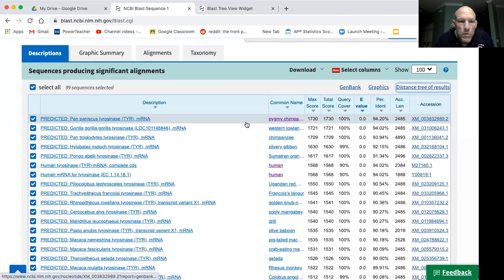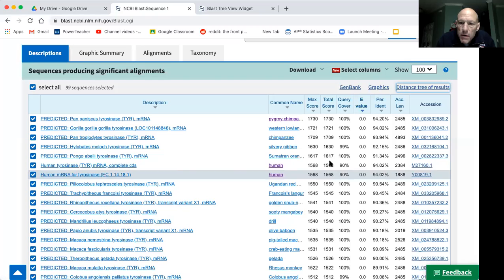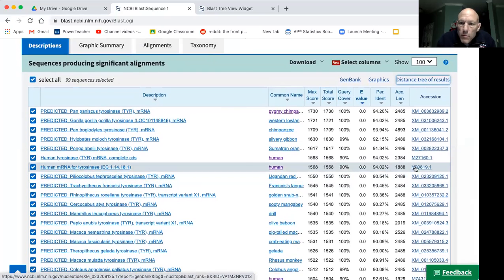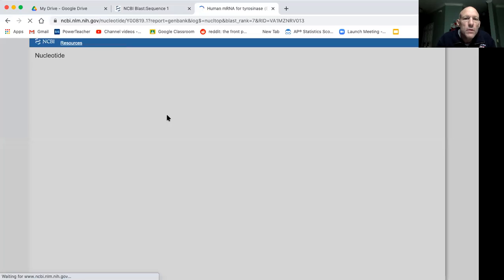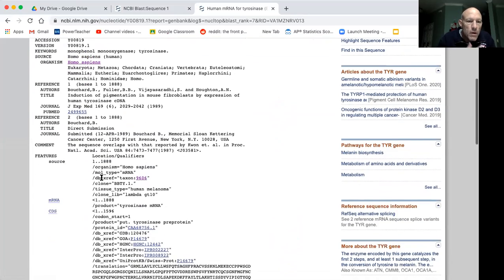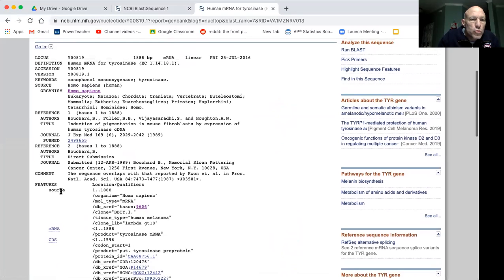I'm going to try one more time here to find a publication. So I'm pressing on here again. I just think some of these don't have publications. Here it is.